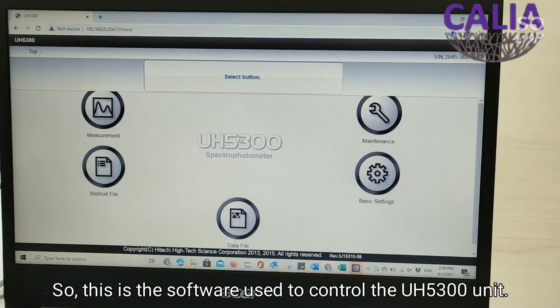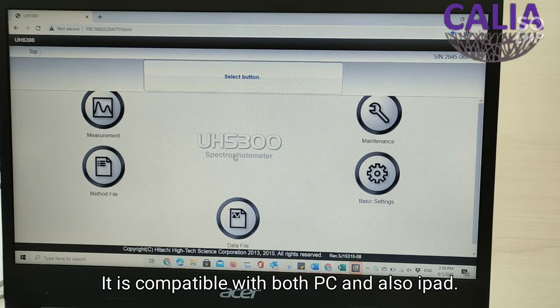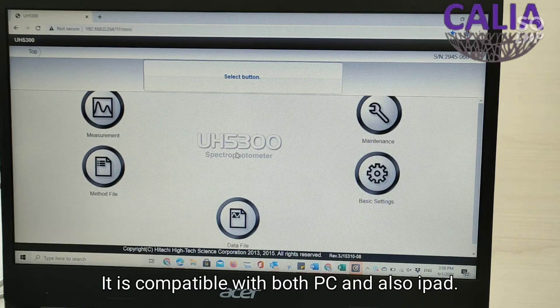This is the software used to control the UH 5300 unit. It is compatible with both PC and also iPad.